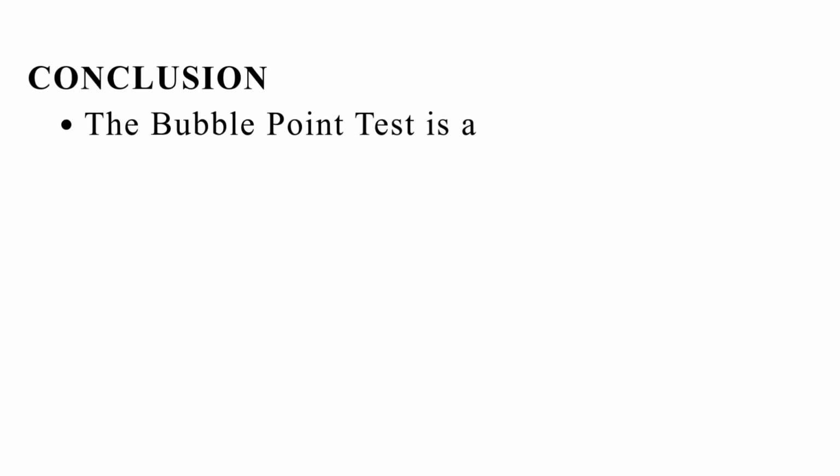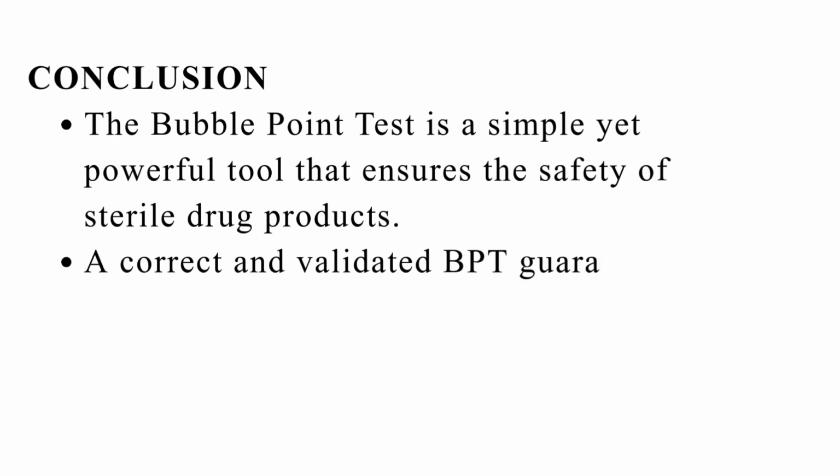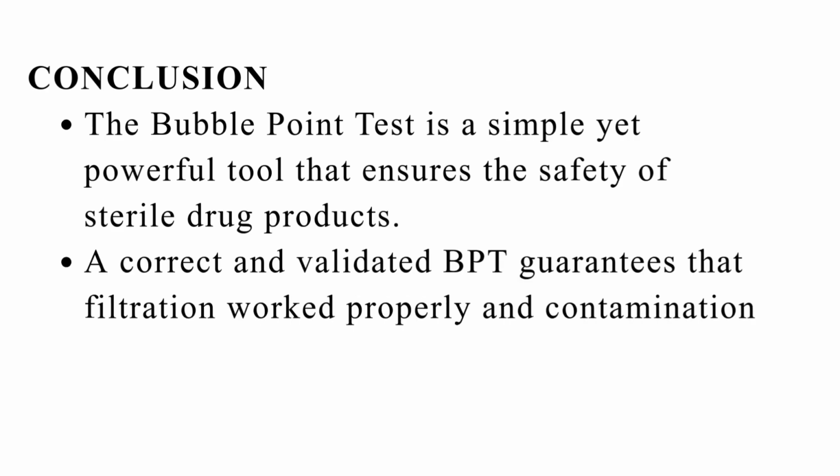Conclusion. The bubble point test is a simple yet powerful tool that ensures the safety of sterile drug products. A correct and validated BPT guarantees that filtration worked properly and contamination risk is minimized.